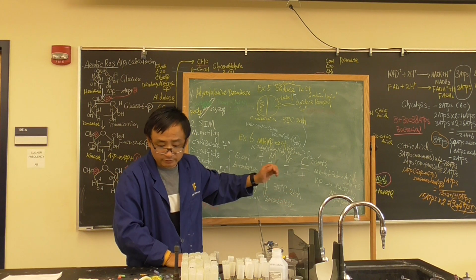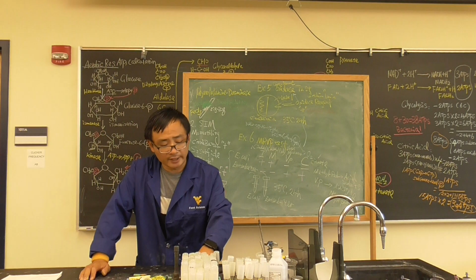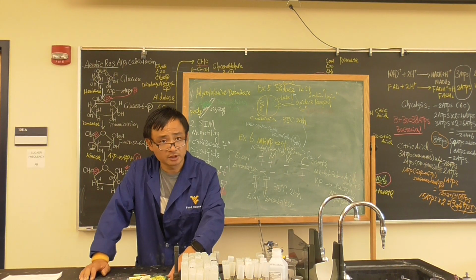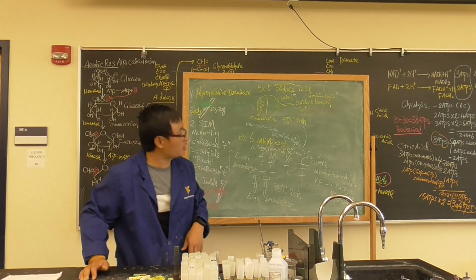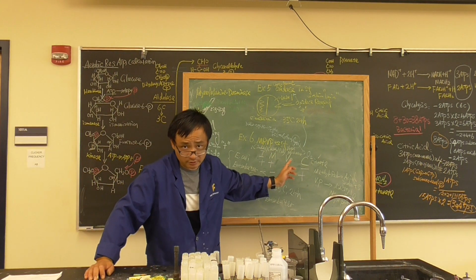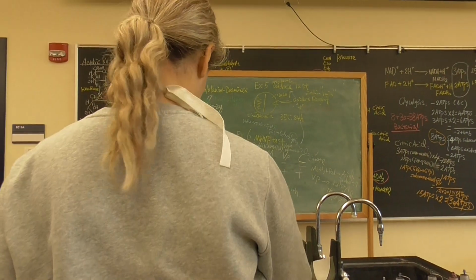Next week Tuesday, we will do 3 plates, another biochemical test, to see whether they have protease, lipase, and also amylase. Then we need to do the confirmation tests for the oxidase test and the MRVP test. So that will be our job. Okay? Good.